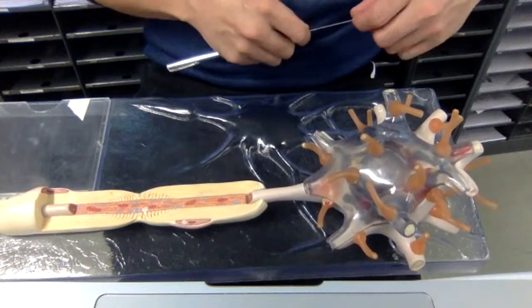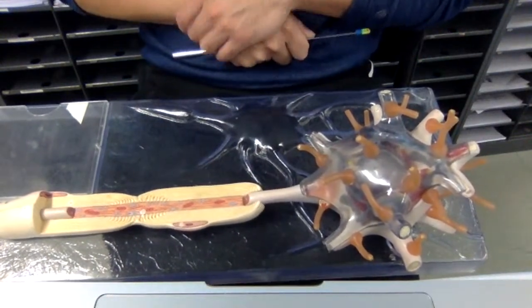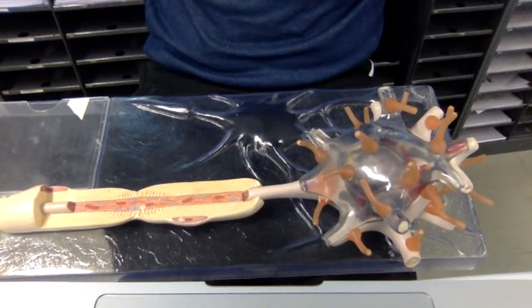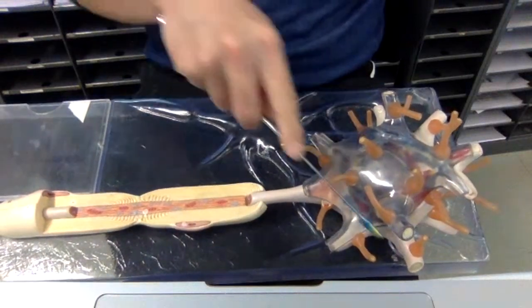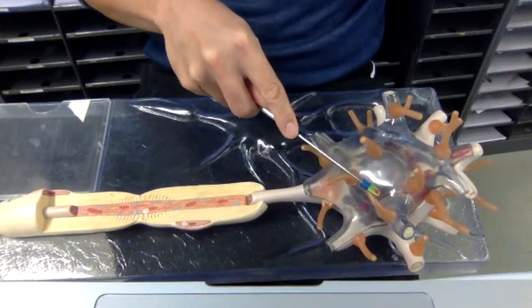What is the shape of this neuron? How long is this lag? Let's see. No answers yet. Got lots of dendrites, lots of input.